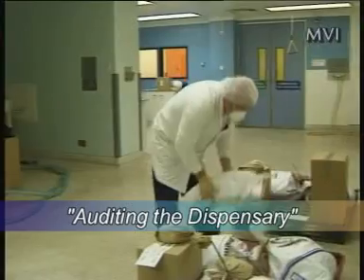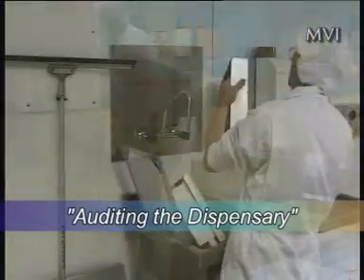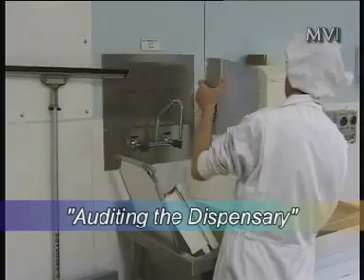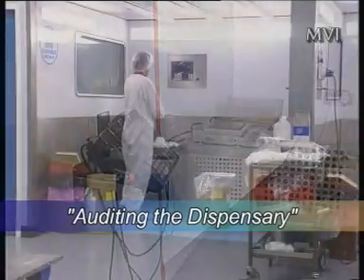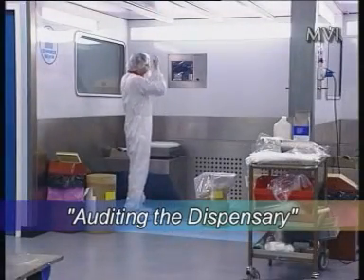And don't forget, it's not just the room that has to be clean. There are the utensils and equipment as well, including spatulas, measuring cylinders, balances, etc. Questions to ask: balances come in a range of sizes, from laboratory high-precision balances for weighing very small quantities of materials, most likely to be active pharmaceutical ingredients, right up to weigh cells for weighing multi-kilogram quantities of excipients.